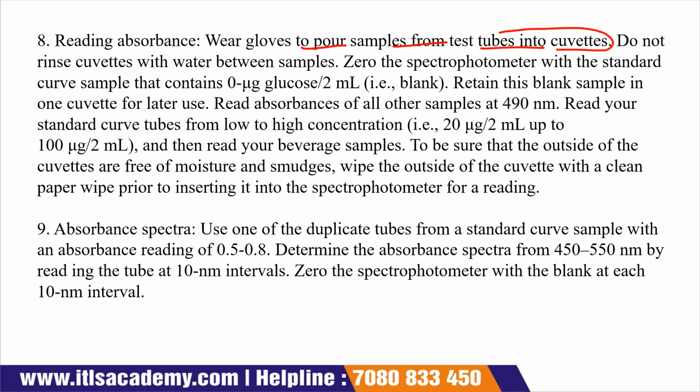Okay, when we are pouring the sample into a cuvette, we have to wear gloves because of the sulfuric acid and the phenol compound. Do not rinse the cuvette with water between samples. In that case, we are not going to rinse it with water.